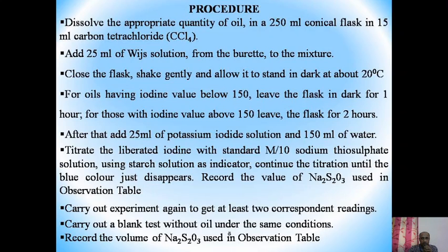Carry out the experiment to get at least two concordant readings. Carry out a blank test without oil under the same conditions. Then record the volume of sodium thiosulfate used in the observation table.